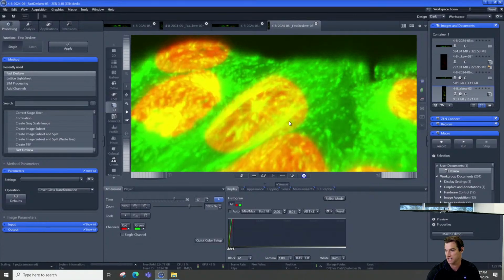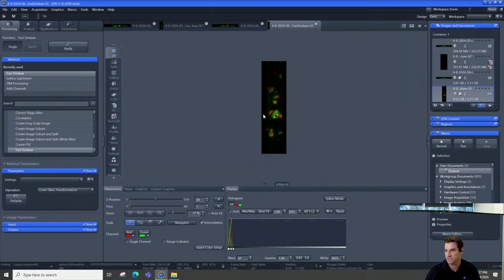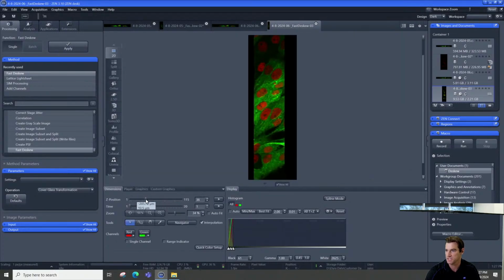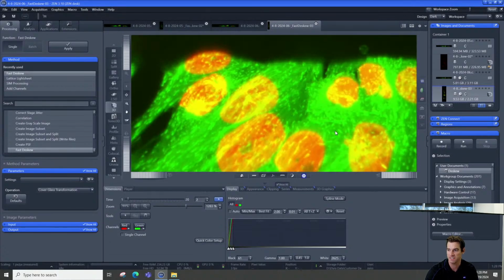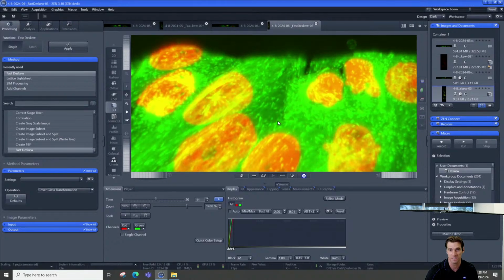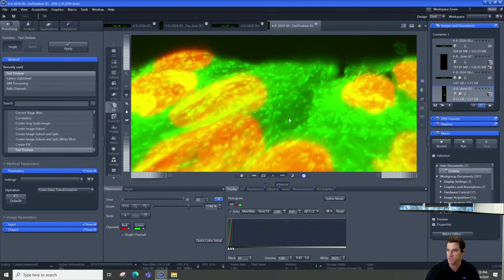You have the gentleness. And actually, I didn't even mention that. I didn't even think about laser power in this case because I just don't have to worry about photobleaching. It's so much gentler than anything else that exists. Photobleaching in this case just was not going to be an issue. It's not even a concern. And so a conversation we often have is, what experiment would you design if you didn't have to worry about photobleaching anymore? What would that look like? Can't guarantee that that is actually going to be literally the case, but it gets closer to the reality of what you can do with this system oftentimes.